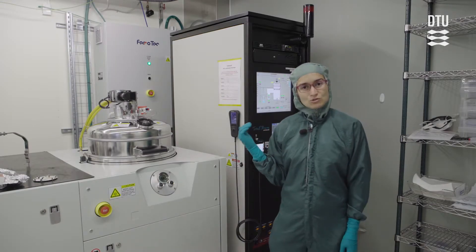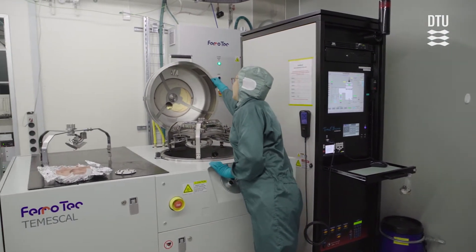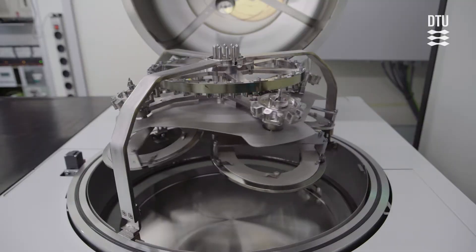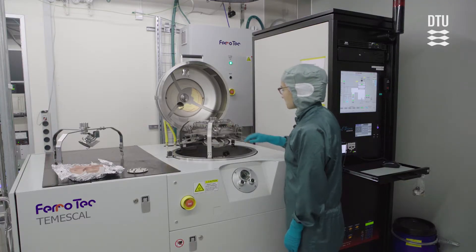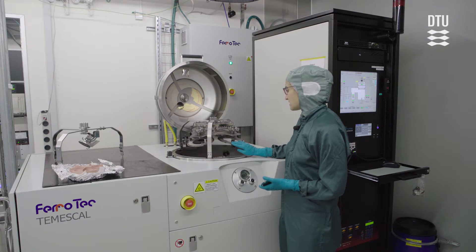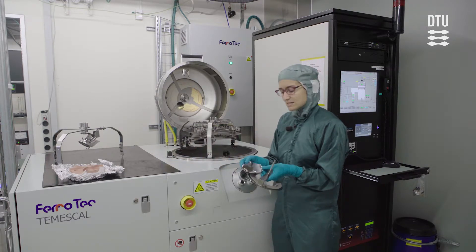When you arrive at the instrument, you're going to need to vent it. Once it's vented, you will see that inside of the load lock we have the sample holder system. It's a rotation system with planetary motion, which ensures very uniform deposition on your samples. We have a variety of different sample holders. You can put in six-inch wafers directly, and with an insert you can put in four-inch wafers, and you can also put in small sample pieces.